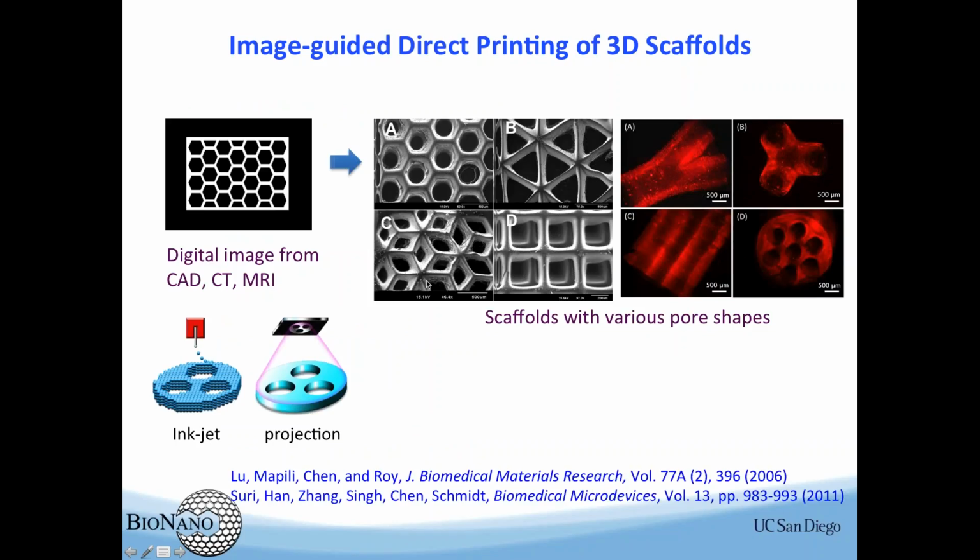When we first started this printing, we just used PowerPoint software, because I'm a nano engineer and mechanical engineer, so we didn't have good support in terms of software. So you can do that by just using PowerPoint. Those are your slides. You have these hexagon patterns. White means light will go through. Black means there's no light. White means I polymerize it. Dark means I don't polymerize, so it stays liquid. That's basically the pattern.